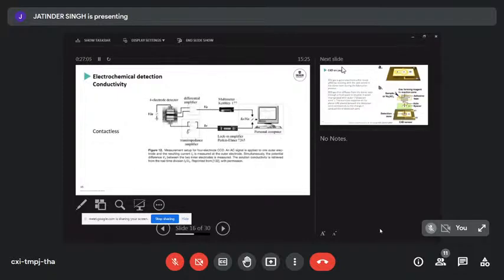This is the $20,000 chip that I just told you about that I magically destroyed by just trying to rinse it. There is the little bugger. It was a 4-electrode system, and these electrodes were actually dug into the ground of the chip and then covered up by an insulating layer.